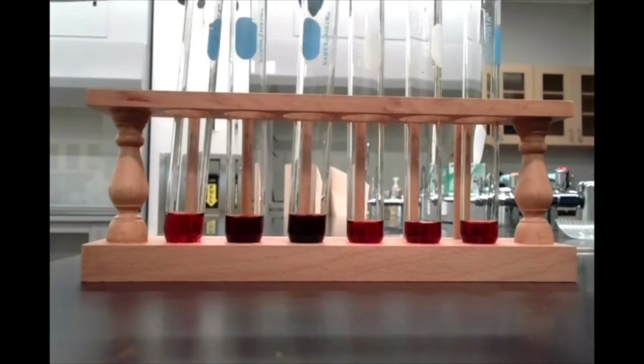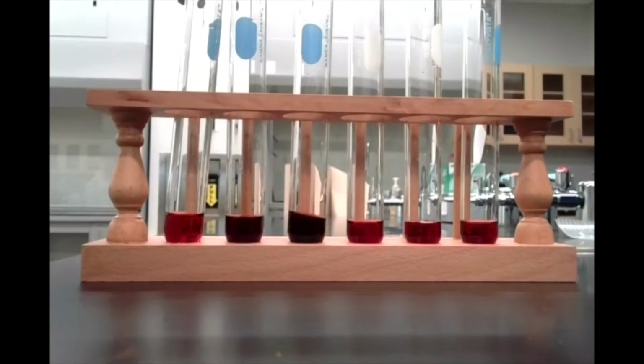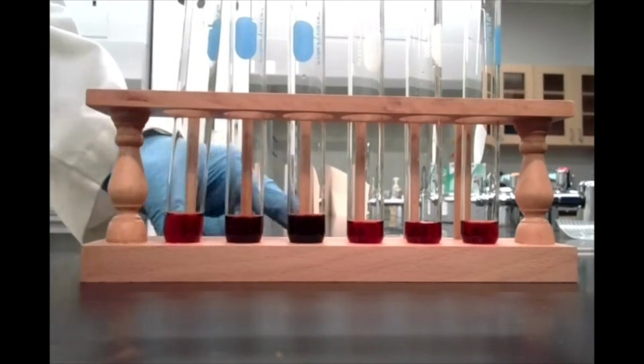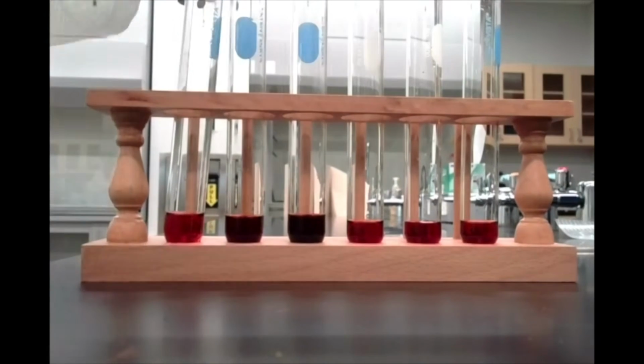Okay, and give it a good shake, and once again, you can compare its color to our reference test tube, and again, you should be able to see a clear difference between these two test tubes.